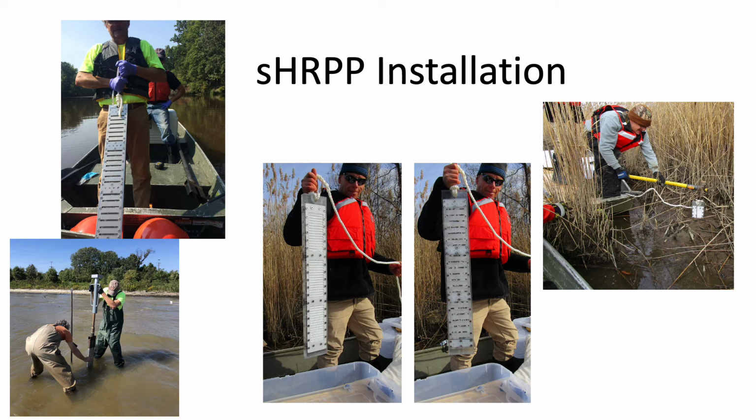The only problem that can occur is if there are cobbles or gravel, which make the insertion of the samplers too difficult. And in this picture, just showing you a couple of real-world applications. This is a stainless steel sampler that was equipped with SPME fibers that is being placed in Abrams Creek at Quantico to evaluate PCBs. This is a sampler being driven in to the embayment at Quantico to evaluate DDX. This is a polycarbonate sampler, and on the back you can see the biosep beads that are present. That was driven in to Canal Creek at Aberdeen Proving Ground, shown here, to evaluate heavy metals.